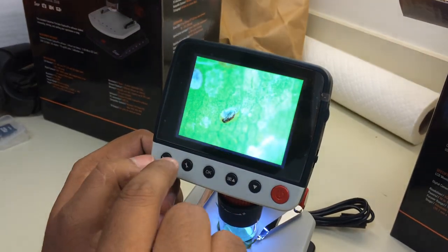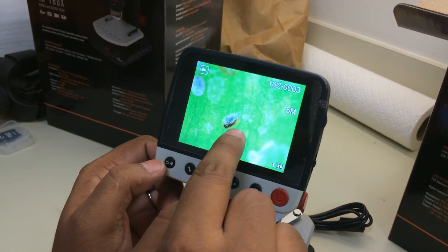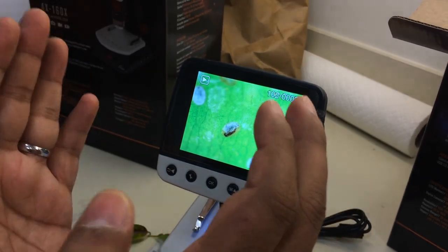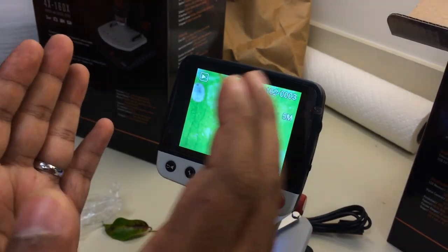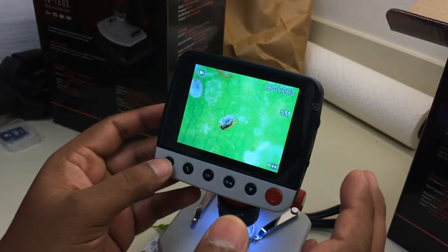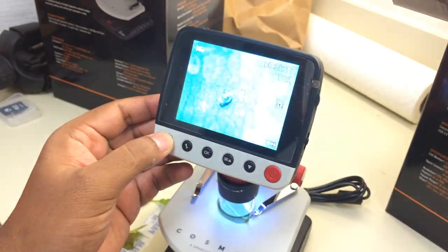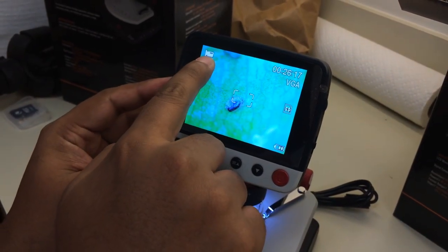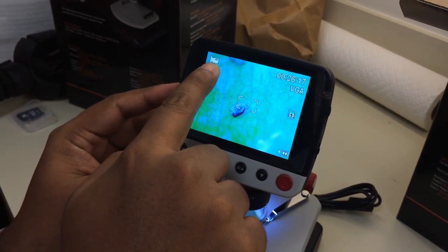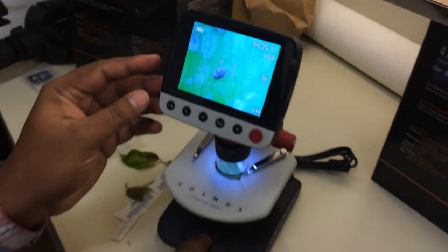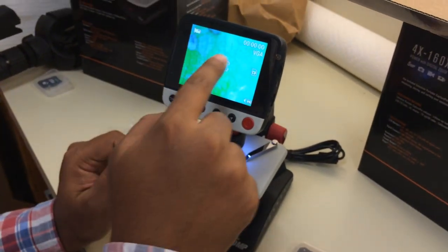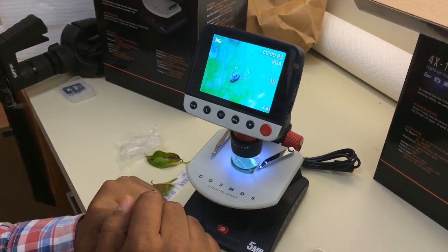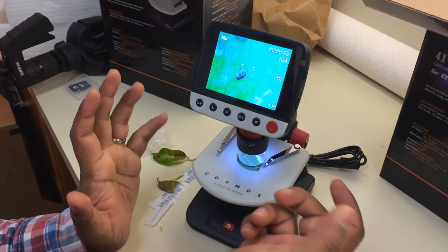If you press this button one time, it will bring you to the place where you can find your saved pictures or videos. However, if you click it a second time, you will see this icon change into video mode.